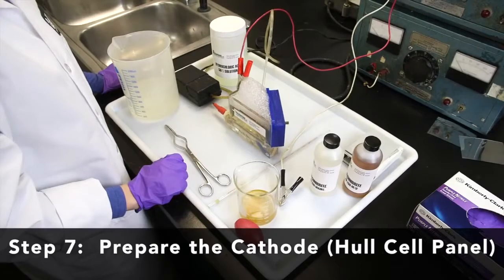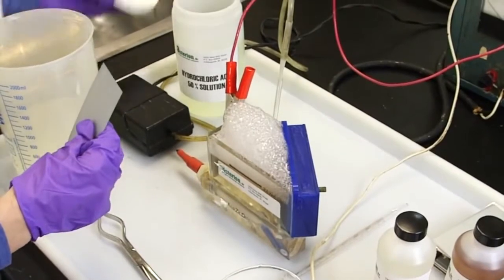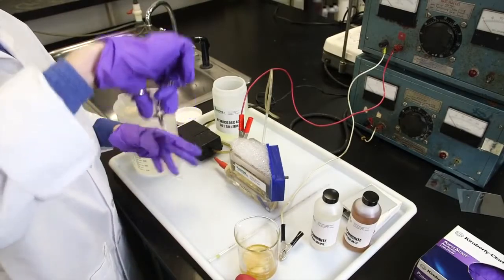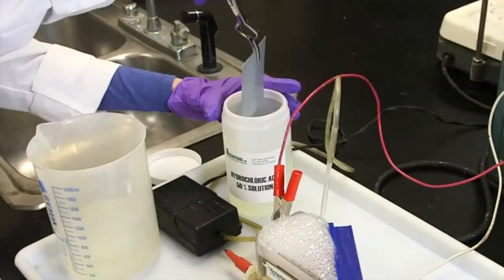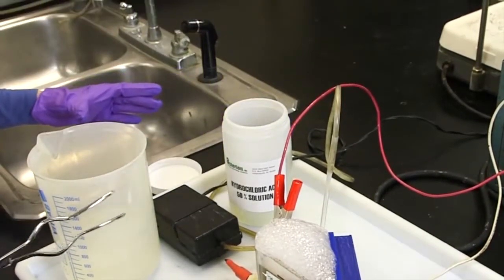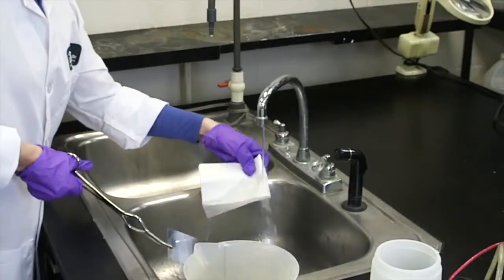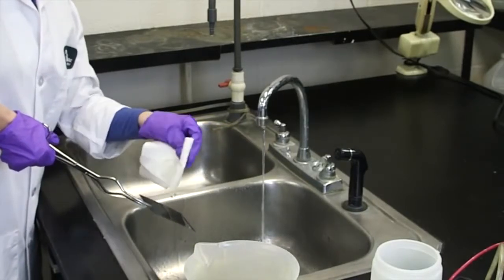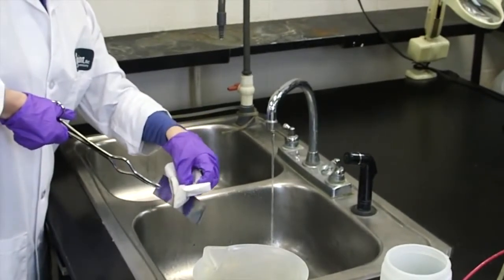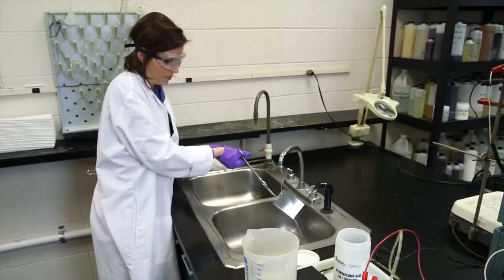Now prepare the cathode or Hull cell panel. For the zinc Hull cell, we are using a zinc-coated panel. Wear rubber gloves and use lab tongs for safe handling and to prevent contaminating the panel. Immerse the zinc-plated steel panel in a 50% by-volume hydrochloric acid solution to strip off the zinc plating. Place the panel under cool running water and wipe the surface with a wet cotton cloth or wet paper towel to ensure cleanliness. This will remove small particles from the surface that can interfere with the evaluation of the deposit. Rinse again with cold water until you see a water-break-free surface.